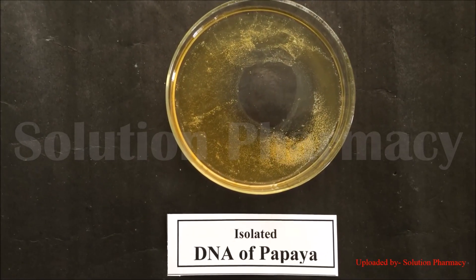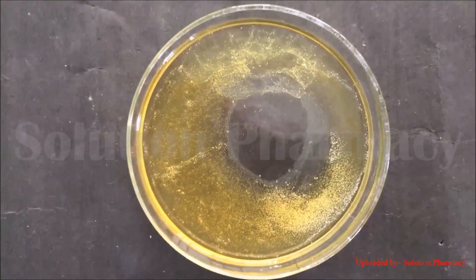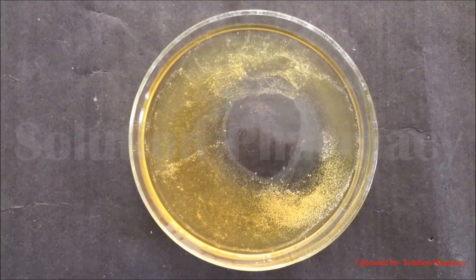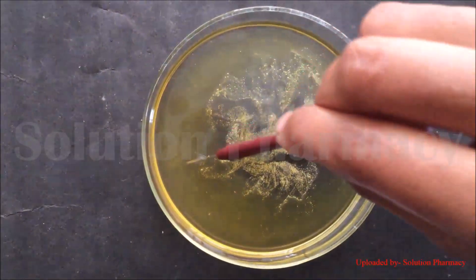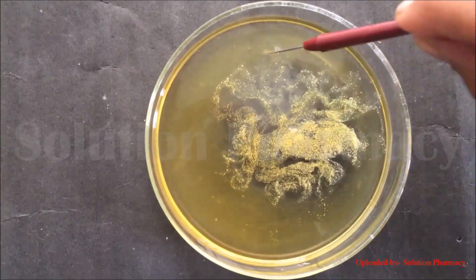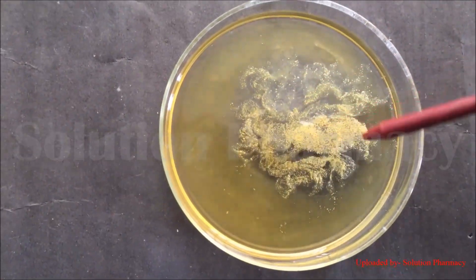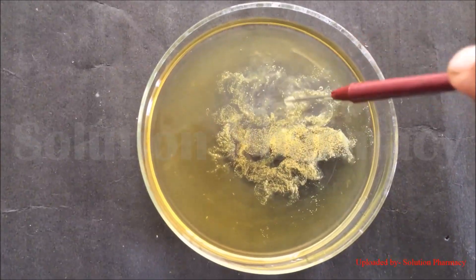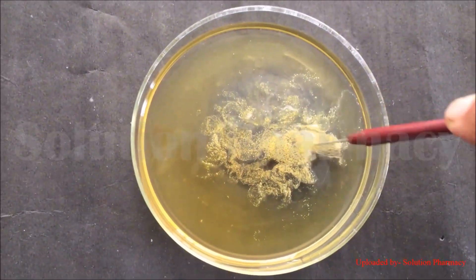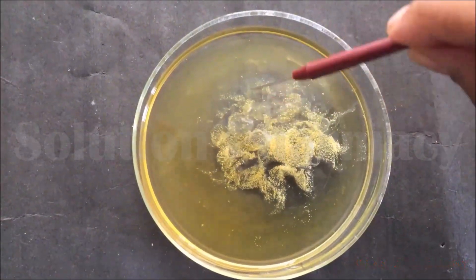After two minutes you can clearly see the DNA in the petri dish — a network of fiber-like structures with cloudy white color floating on the surface of ethanol. We accumulate the DNA at one place with the help of needles for easier visualization. The lipids and proteins settle to the bottom due to higher density, while the DNA, being less dense, rises and floats over the alcoholic layer. After five minutes, more and more DNA precipitates out as a white cloudy structure.